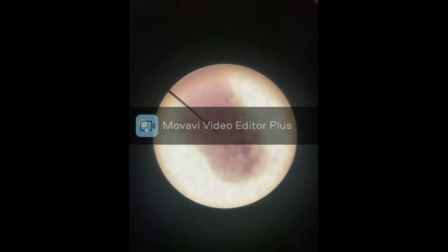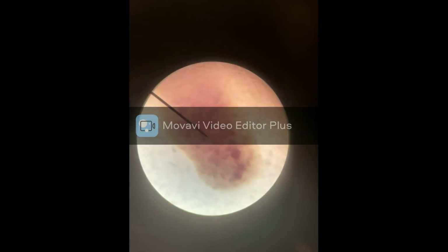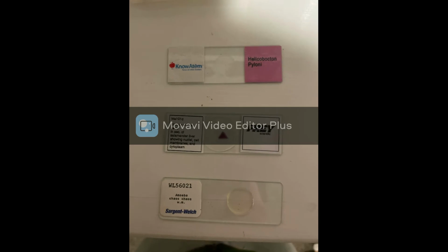And another single-celled eukaryote, like Paramecium, this time this one's called amoeba. And we can see medium zoom here. It's a little hard to see anything going on there, but when we get a little more zoomed in, we can start to see some organelles. Those are the little slides that we just used there.